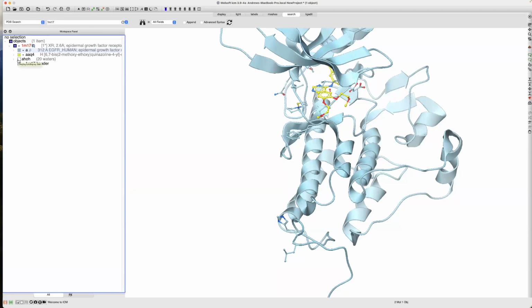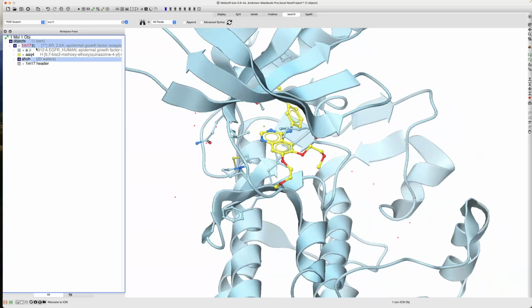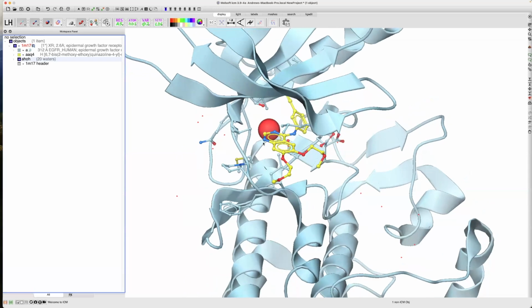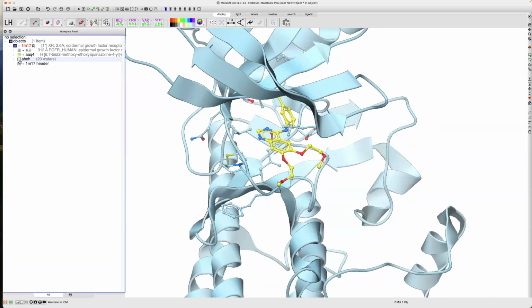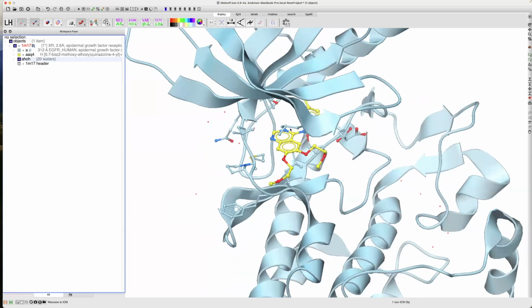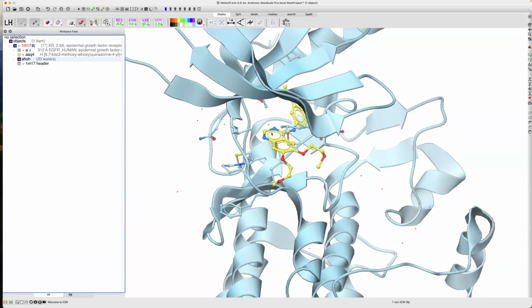If we inspect the pocket, we'll see there's this water molecule here, which, if we're going to redock this ligand eventually, we need to keep in the pocket because it makes hydrogen bonds, like a water bridge, between the ligand and the receptor. We'll see that in a minute once we convert it to an ICM object. So if you want to reproduce the binding pose of erlotinib, which is what we're going to do, we probably need to keep that water, although ICM actually redocks it pretty well without it.